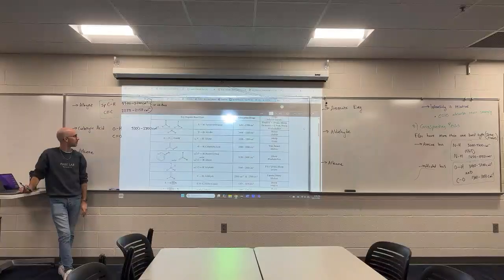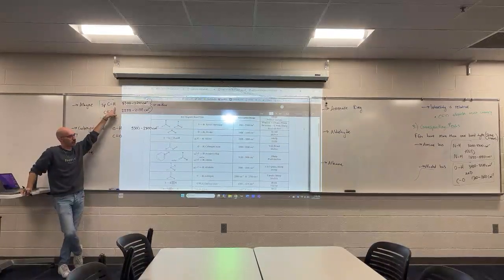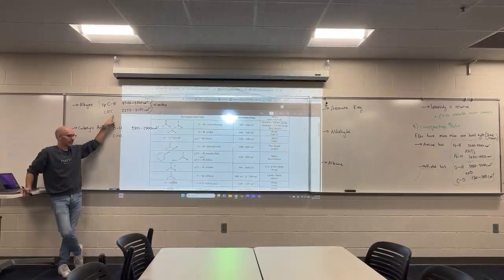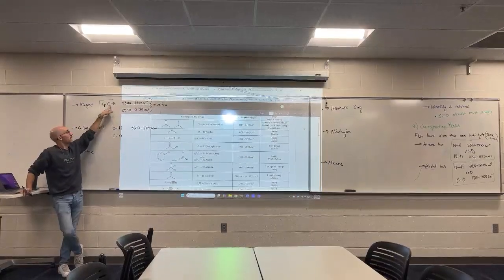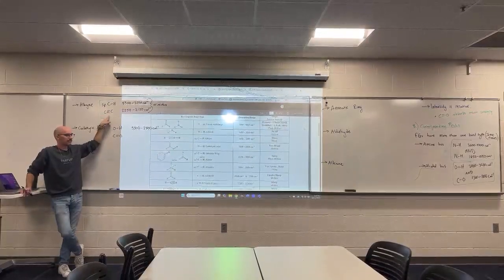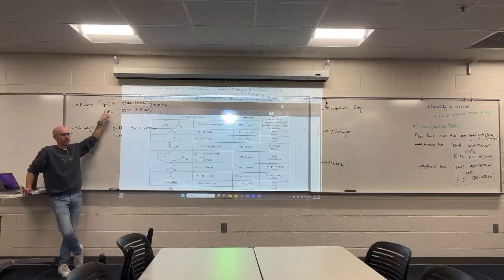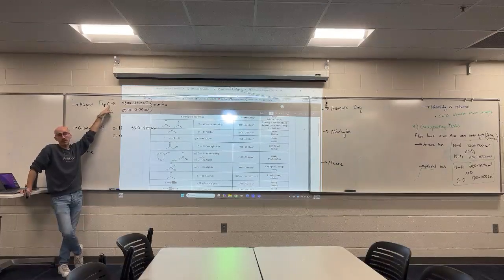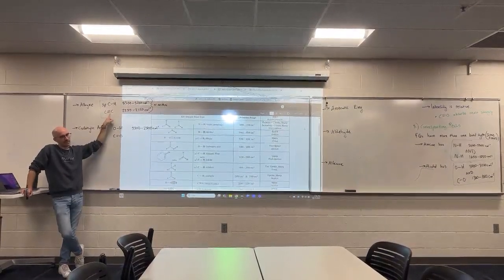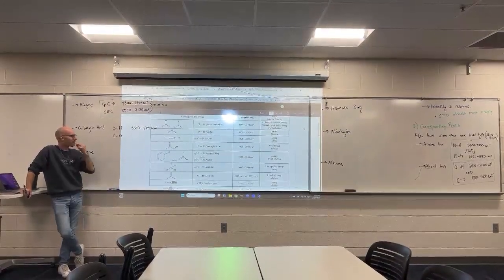Can you remind me, why did you write "or neither"? If the alkyne is not bonded to a hydrogen, then it likely will not experience a change in dipole in the CC triple bond. Oh, is it because, yeah, okay. So if this is not present, this likely won't absorb. Because you don't need this to have an alkyne. All you need is this. So there are alkynes that have CH bonds. There are alkynes that don't. And if the alkyne does not, then it likely won't absorb here either. And so you'll either see both or you won't see either. Sorry, I didn't mean to interrupt. That's okay. I realized I missed the explanation.